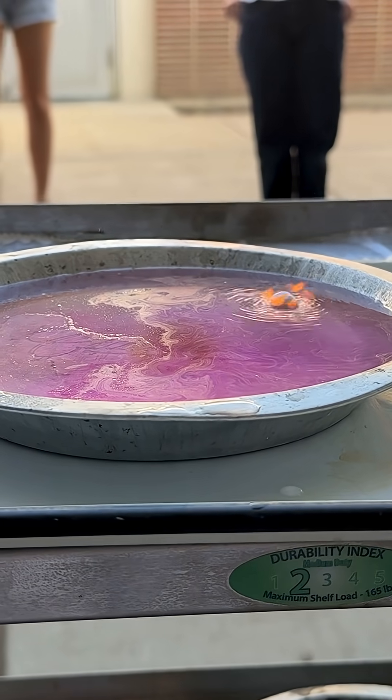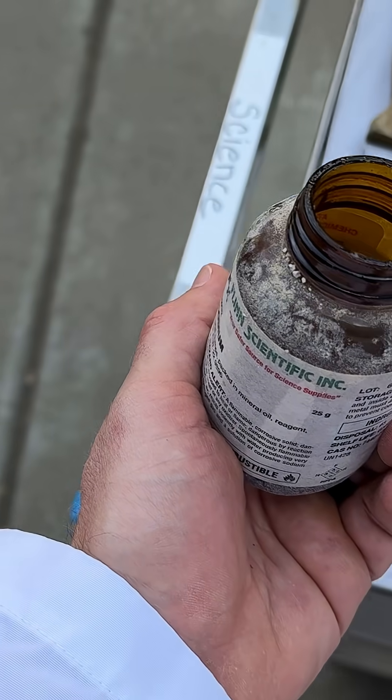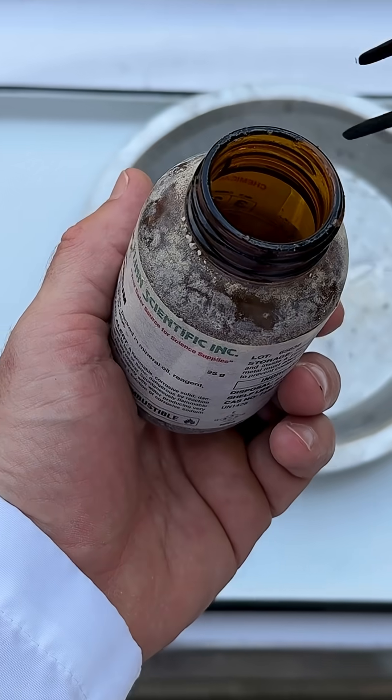Sodium. This is where things get good. Sodium is — I don't know if we go so far as to say freakishly reactive, but it is highly reactive.